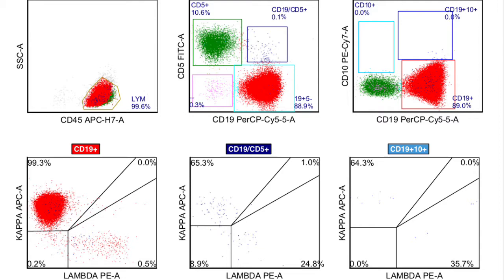This middle panel also shows us that the B-cells are CD5-negative. And on the right-hand side of the top row, you'll see that these CD19-positive B-cells do not co-express CD10. Importantly, looking at the lower row on the left-hand side, you can clearly see that the B-cells are almost exclusively surface kappa-restricted, indicating that this is a B-cell neoplasm that is not declaring what it might be, as it is CD5-negative and CD10-negative. This leaves a differential diagnosis of a small CD5-negative, CD10-negative B-cell neoplasm, something along the lines of perhaps a marginal zone lymphoma or a lymphoplasmacytic lymphoma.